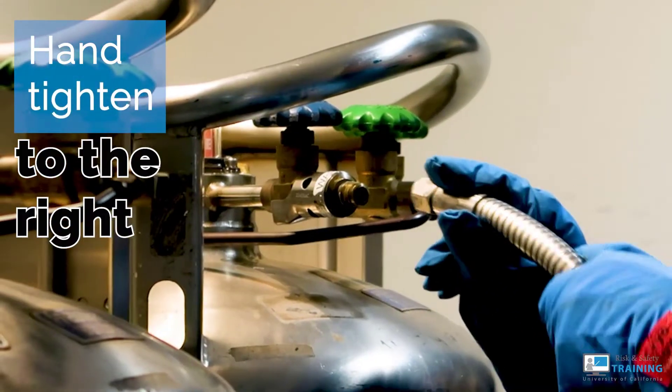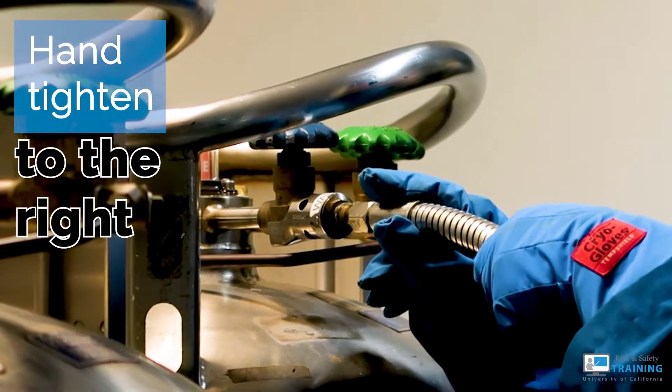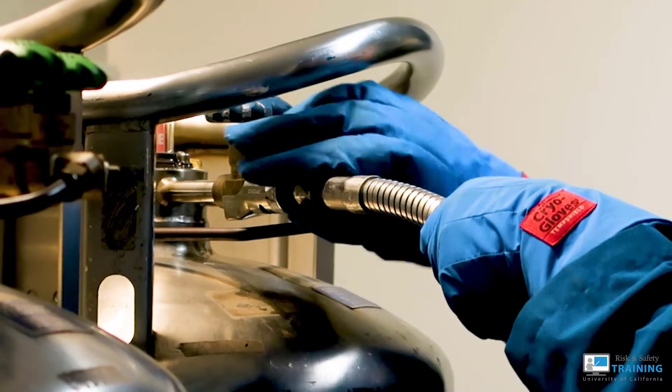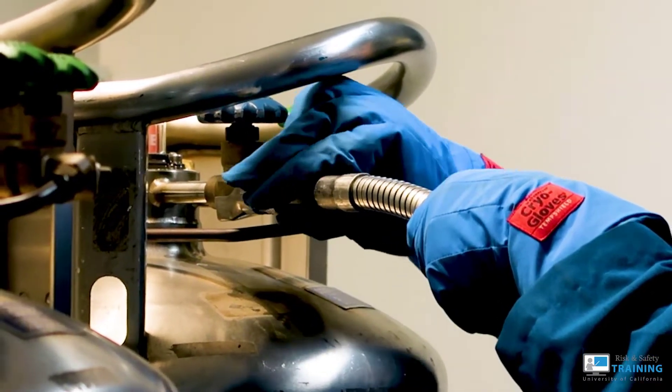To attach the transfer hose, hand tighten first by twisting the nut onto the valve. A good rule of thumb is lefty loosey and righty tighty.